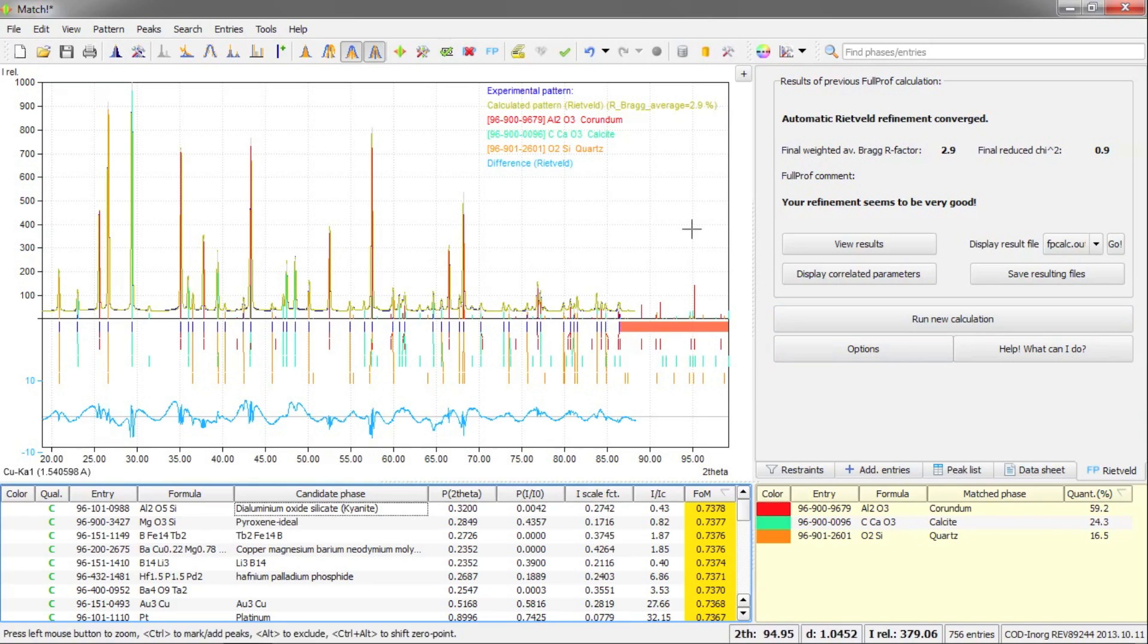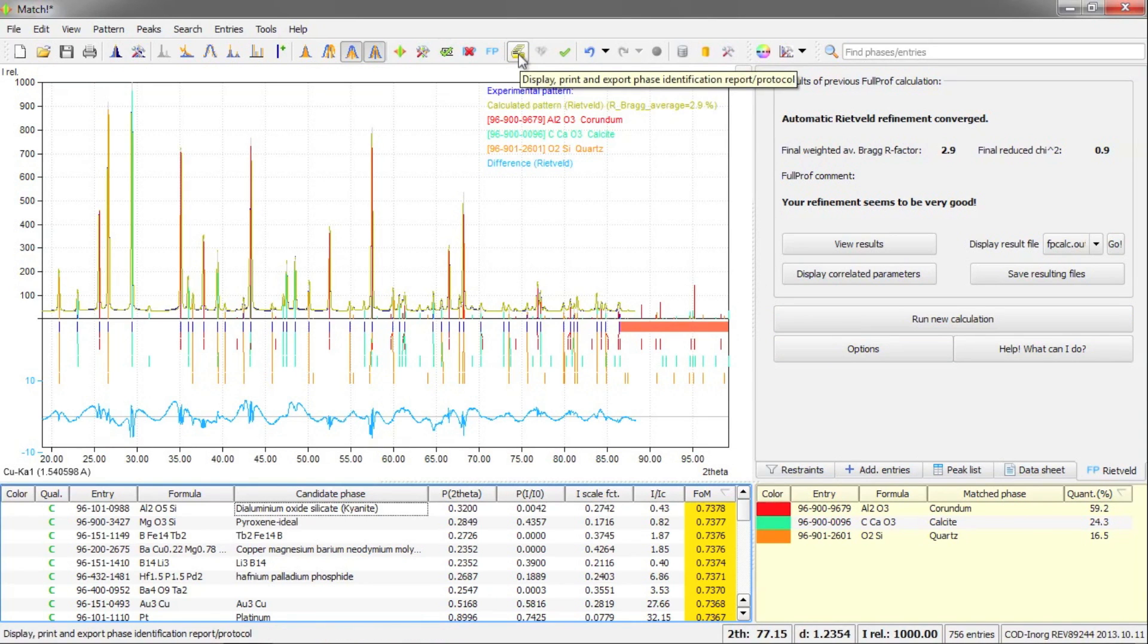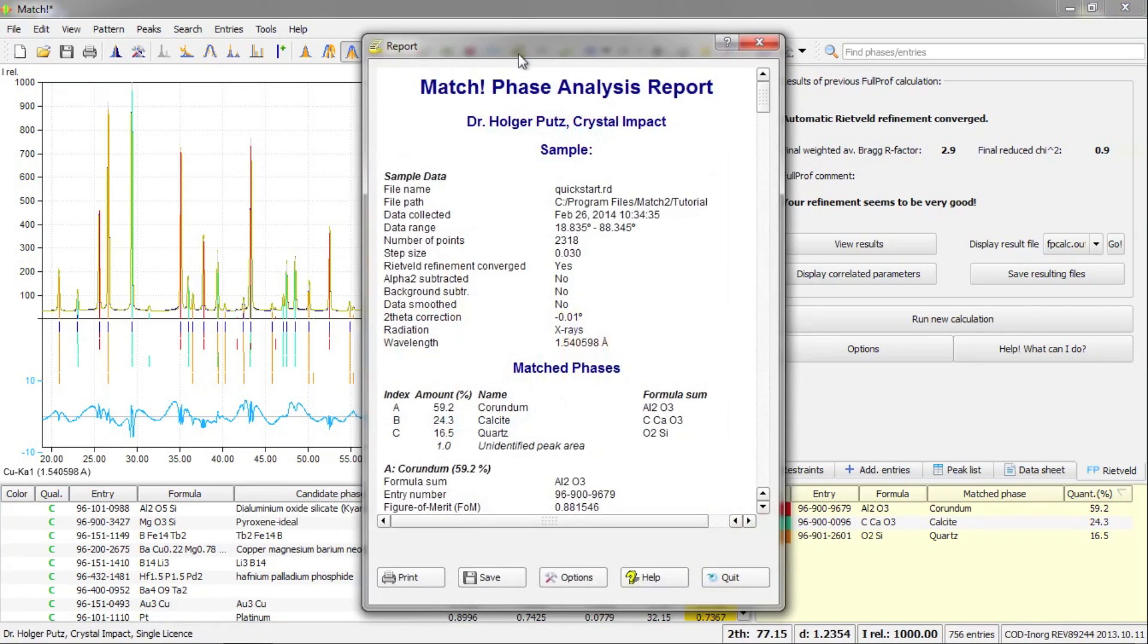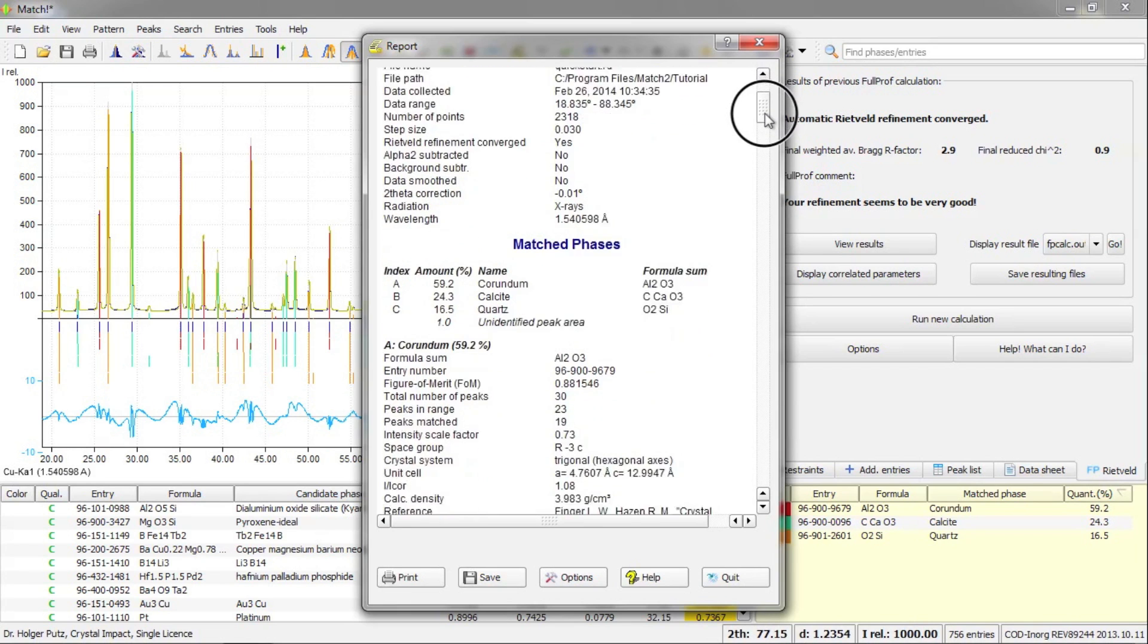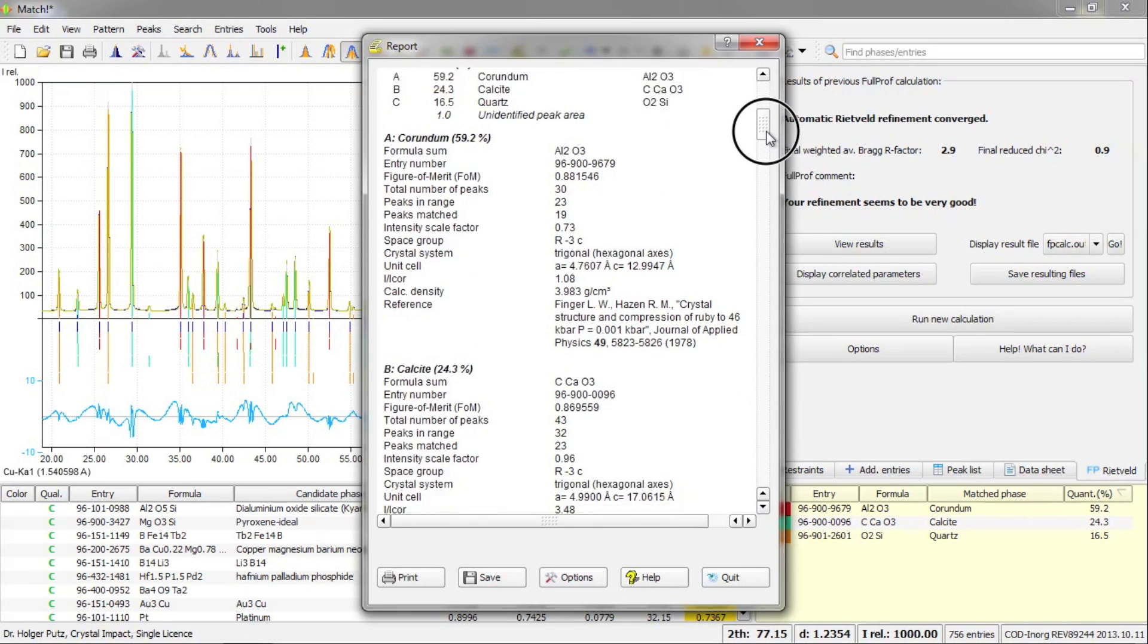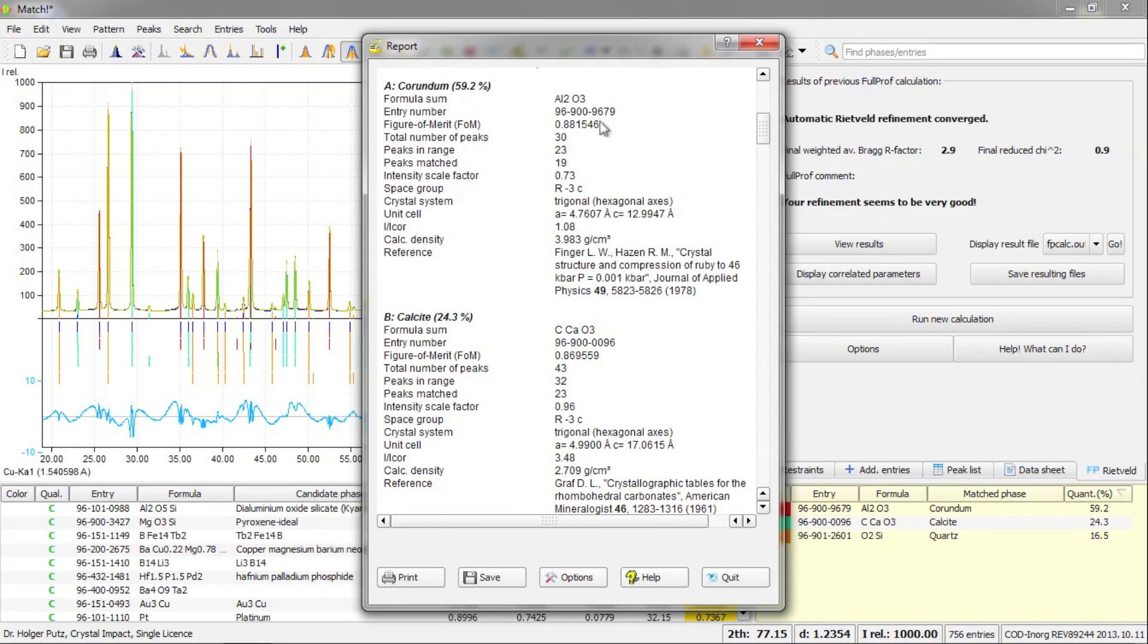All that remains to do now is to take a look at the report of what we have done and what we have found. So I have pressed this button in the toolbar to create the report. And now we have this report in a separate window where you can see all the details of the experimental diffraction data.